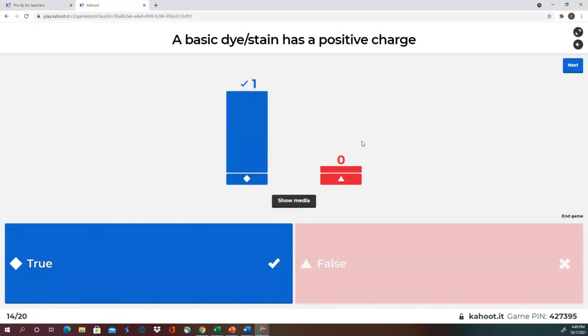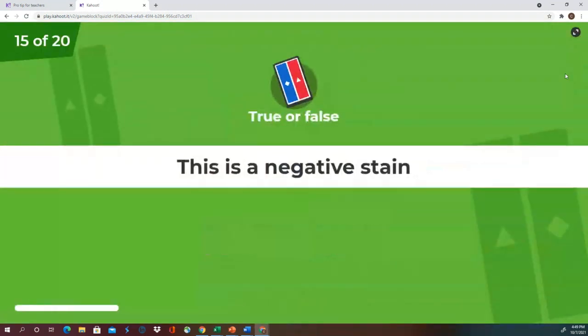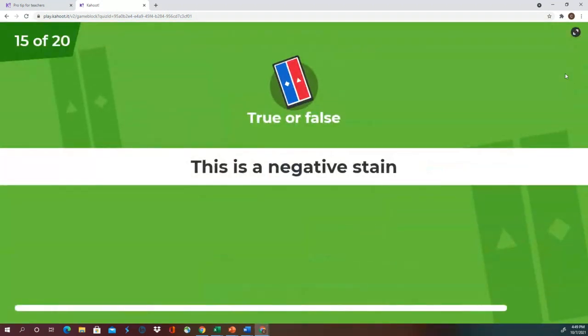With an acidic stain, that means it's negatively charged. So the stain is going to repel the cell. So you're gonna get a nice, pretty dark background and bright white, colorless cells. So it's pretty neat looking, and you'll see pictures of those in a few minutes. Or right now.